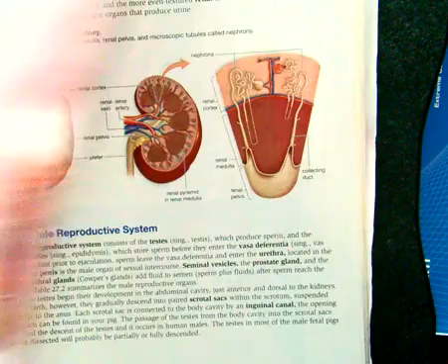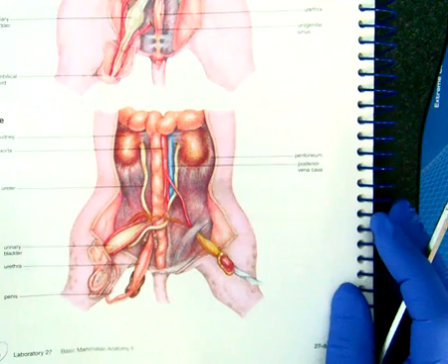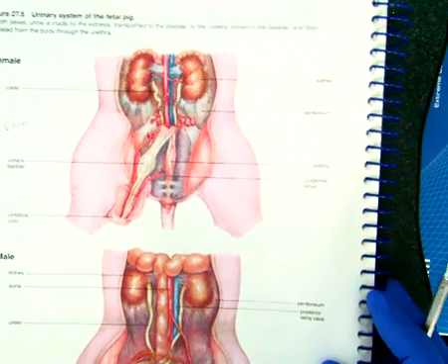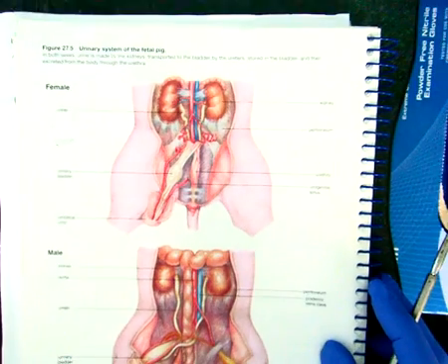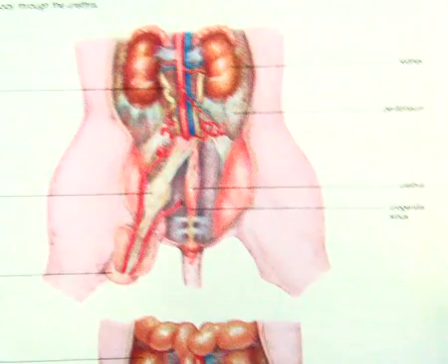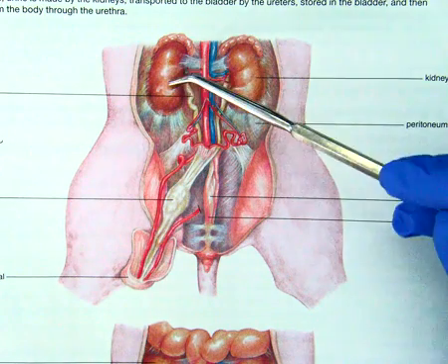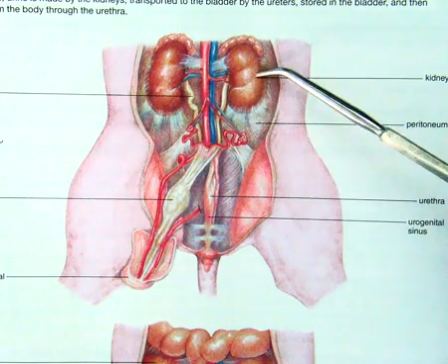All right, and I've copied all this for you guys. This image is focusing on male and female, and we'll take female first here. Zoom in a little. So looking at the female tract, and here's the kidneys to mark. We should be able to find those.